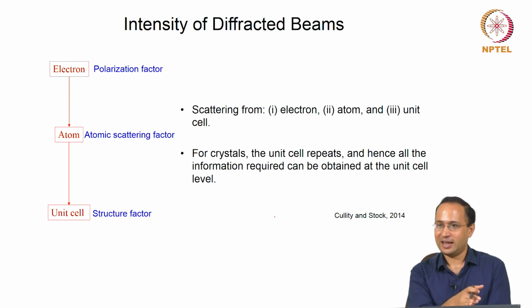Sin theta, in the last slide we discussed how, if you know the HKL plane, we will know the theta where you get the diffraction. Now the question is, what will be the intensity? So that is the question we will answer in the next lecture. We will look into the intensity of diffracted beams. What are the factors which influence the intensity? Okay.